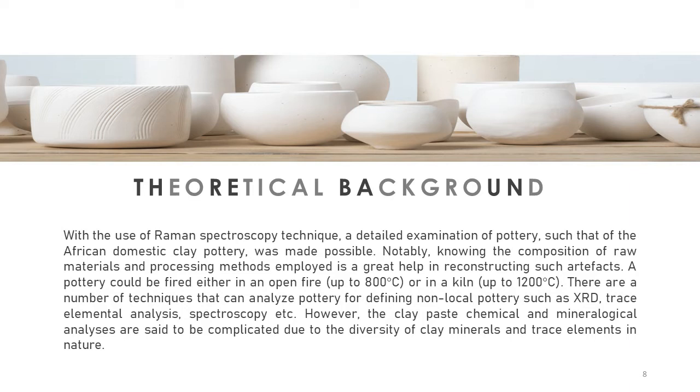In fact, the importance of this subject has already been demonstrated in the literature. Moreover, the chemical composition can be used to define the pottery of a particular area and people by determining the raw materials used. And for very important artifacts, the knowledge of the composition of raw materials and processing methods used will help in the reconstruction of such pieces.